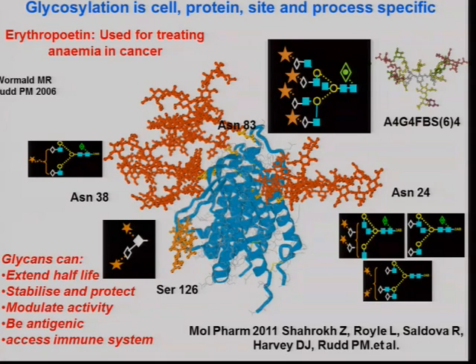No, I mean you have one cell line that produces the same antibody, but with different productivity, so basically different quantities of the antibody. Do you expect a huge change in the glycosylation profile of this product?